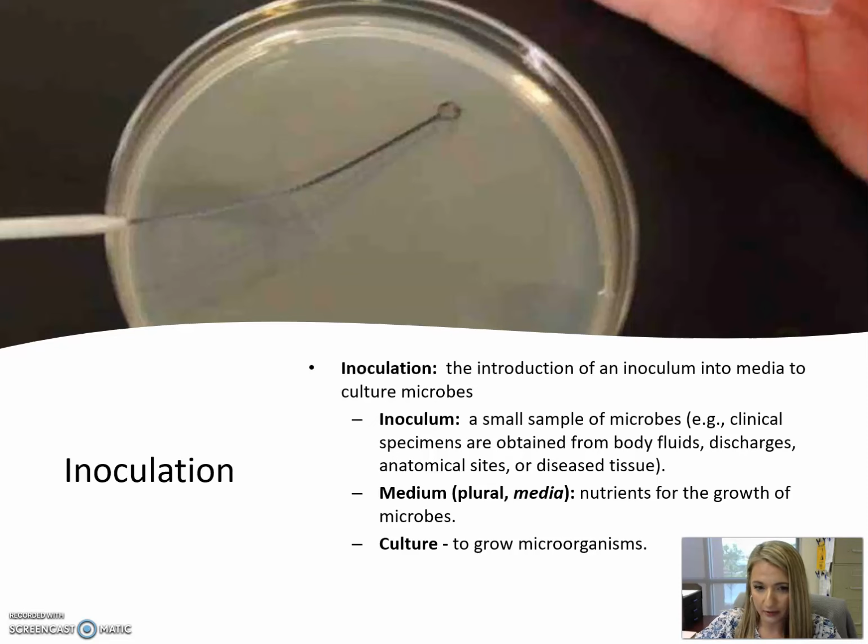But let's break that down. So during an inoculation, you're going to introduce an inoculum into media. So what's an inoculum? An inoculum is just a small sample of microorganisms. It could be a small sample of bacteria or viruses or fungi, whatever it be.